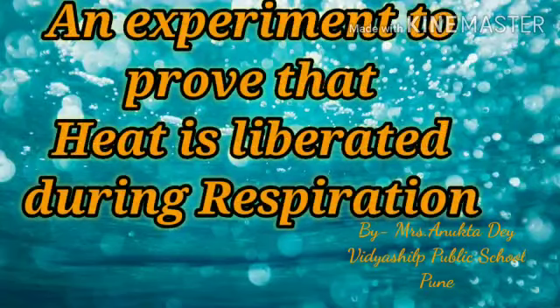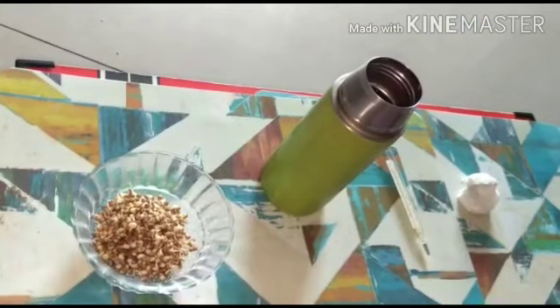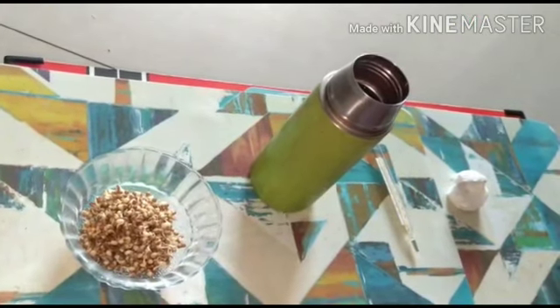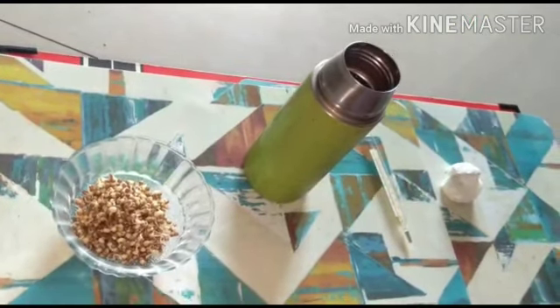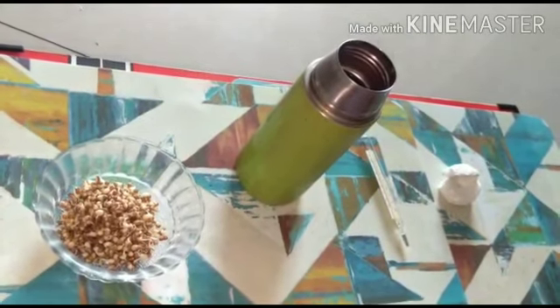Hello students, I am Mrs. Anukta Deh, your biology teacher. Here is an experiment to demonstrate that heat is being generated by the germinating seeds during the process of respiration.